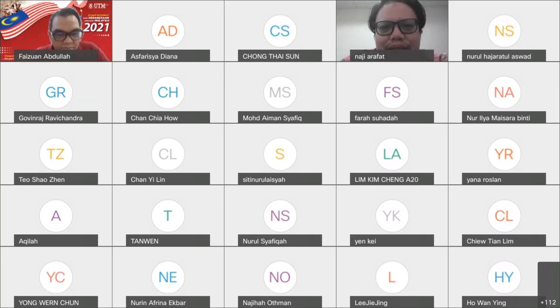Okay, thank you for the question. It's actually a very valid question. To tell you frankly, gravimetric is only one of the many methods available for quantitative determination of metals. It's actually the traditional one, the cheaper one, I would say. As long as the metal can be precipitated with whatever reagent, as long as we can produce a precipitate that we can weigh, you can use gravimetric analysis.